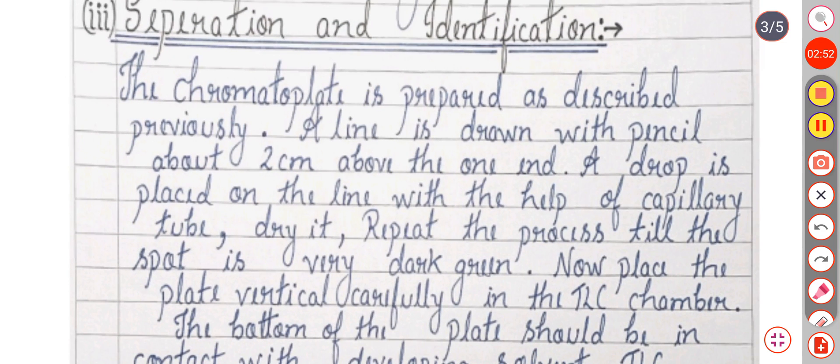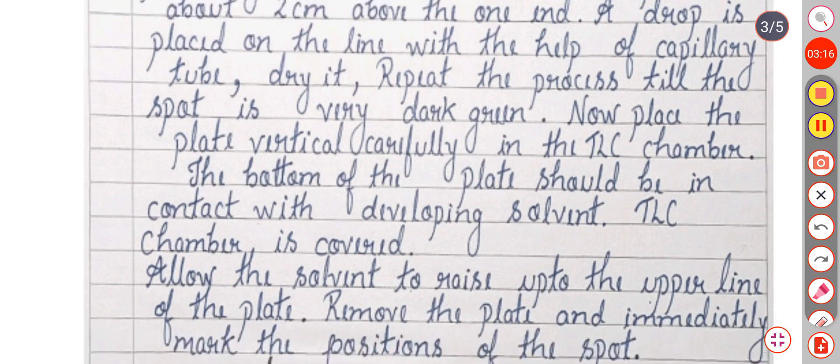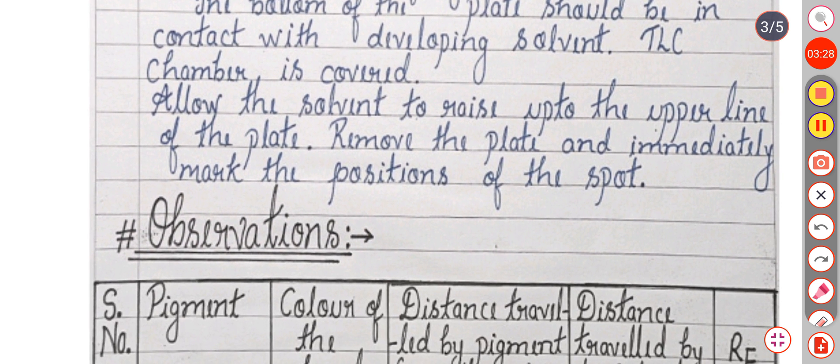The third step is separation and identification. The chromatographic plate is prepared as described. A line is drawn with a pencil about 2 cm above one end. A drop is placed on the line with the help of a capillary tube. Dry it, then repeat the process until the spot is very dark green. Place the plate vertically and carefully in the TLC chamber. The bottom of the plate should be in contact with the developing solvent and the chamber should be covered. Allow the solvent to rise up to the upper line of the plate, remove the plate and immediately mark the position of the spot.